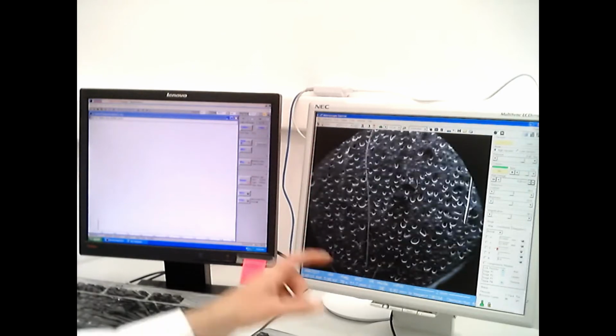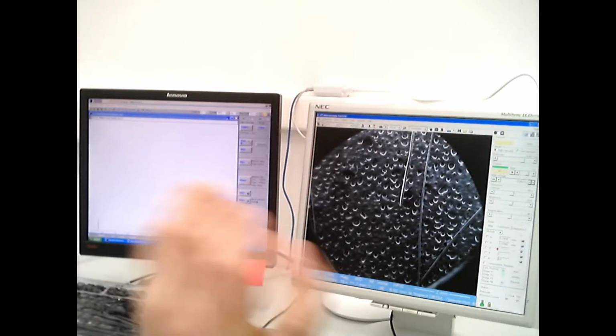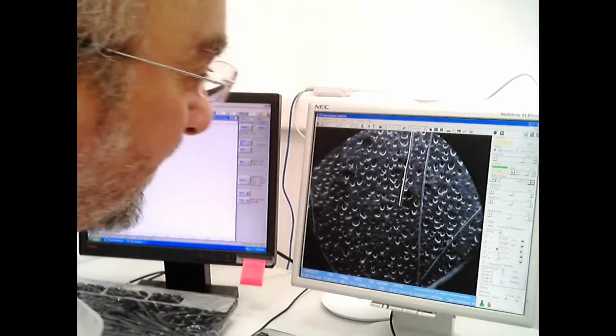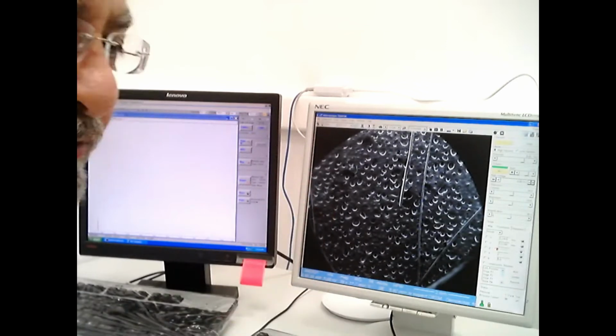It's a regular shape. And this is a cat hair. Over here, this one is definitely a cat hair. It's straighter. It has those pimples on it, and the striations, the cells, are different. So this is now one part of the investigation of human hair. We can find out if any animals were nearby or anything like that.